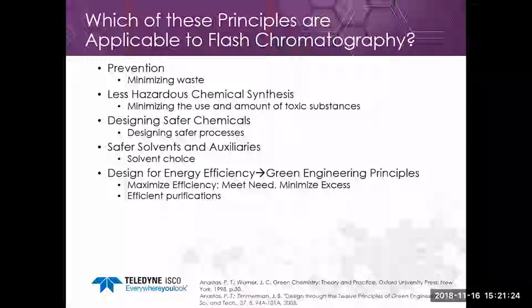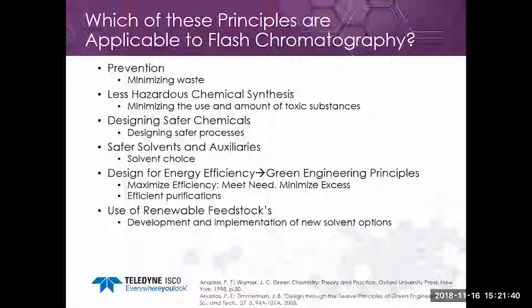So meet your need and minimize your excess. And so really efficient purifications do this. If you make efficient purifications, we're going to minimize excess and waste, and we're going to meet the needs of the purification by getting our compound pure.